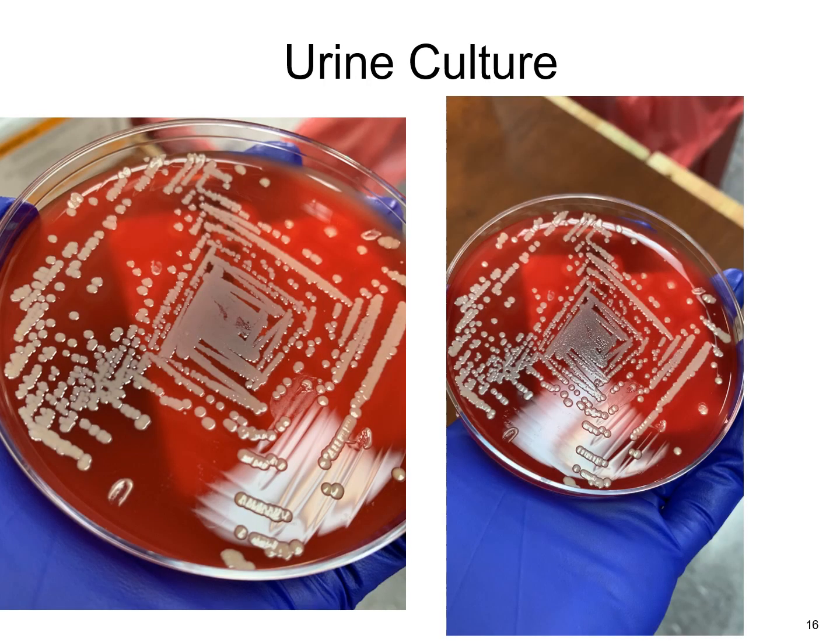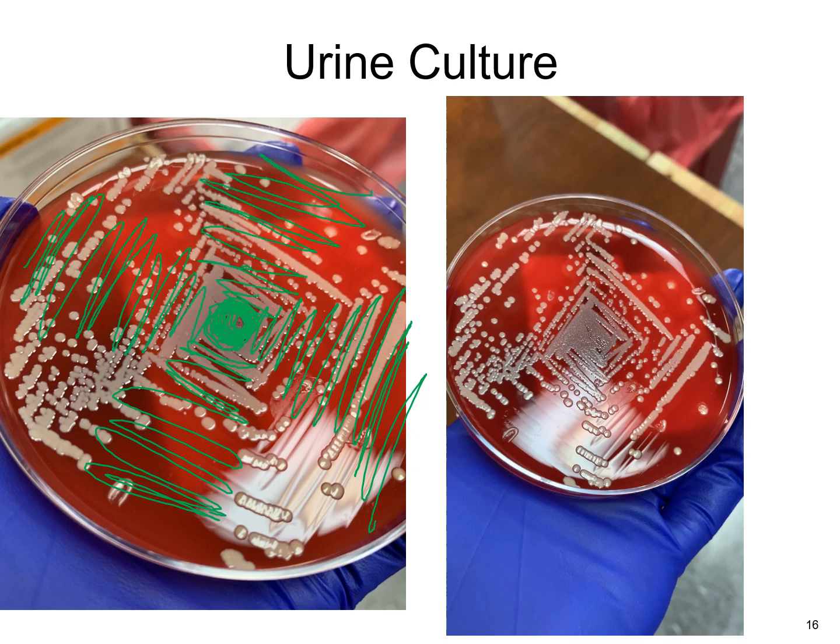Most labs, however, do this technique here where the urine would actually be placed in the center in a little circle. So you would get it on your loop and you would just make a circle. Then you would get a clean loop and you would go into this and you would streak out. Same here, you would streak out and you would just keep going around this plate with a clean edge of the loop every time, or a new loop.